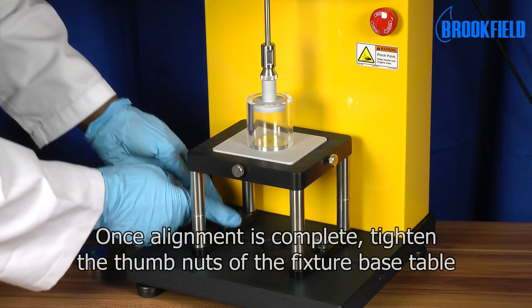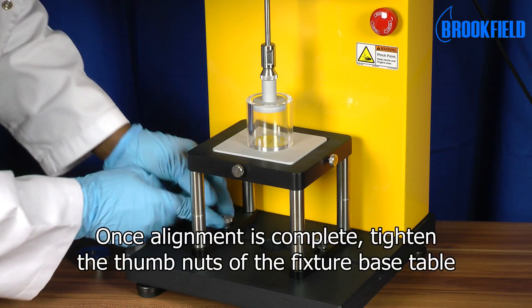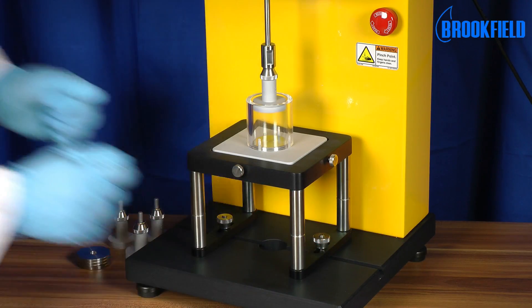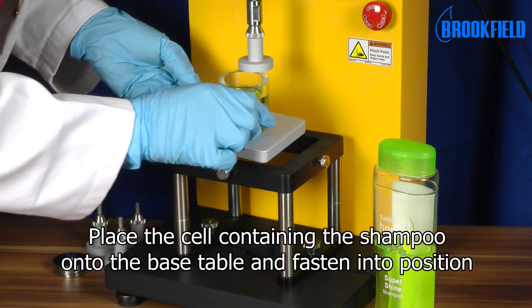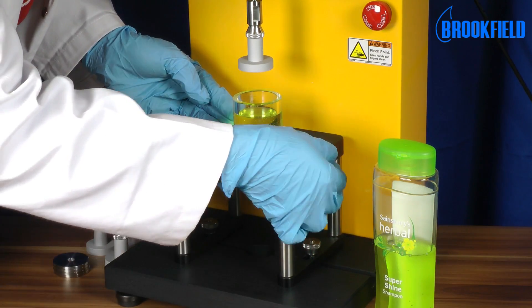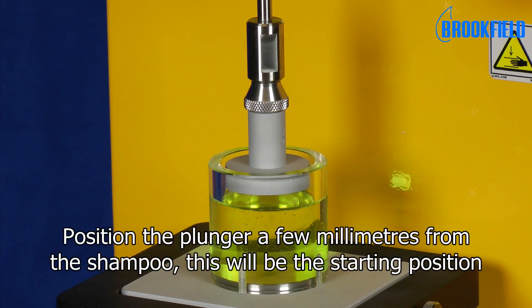Once alignment is complete, tighten the thumb nuts of the fixture base table. Place the cell containing the shampoo onto the base table and fasten into position. Position the plunger a few millimeters from the shampoo. This will be the starting position.